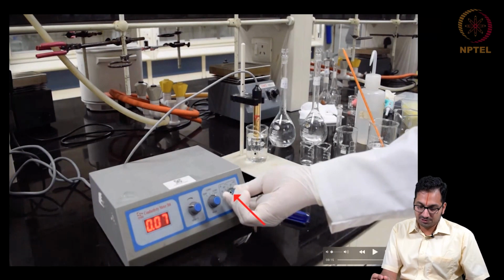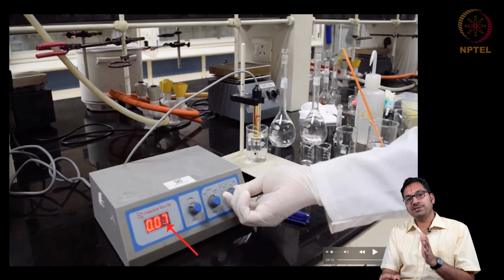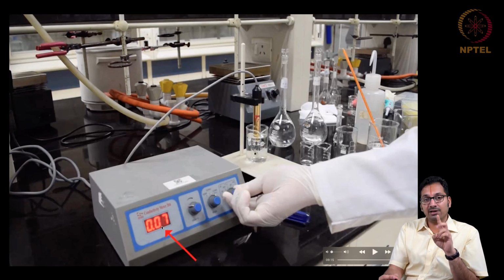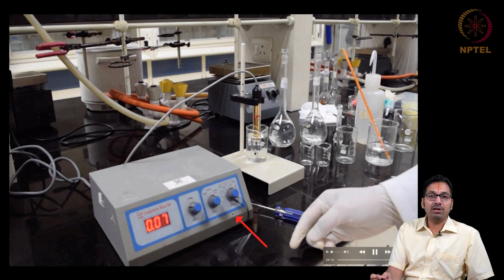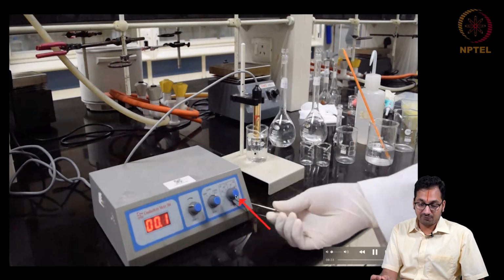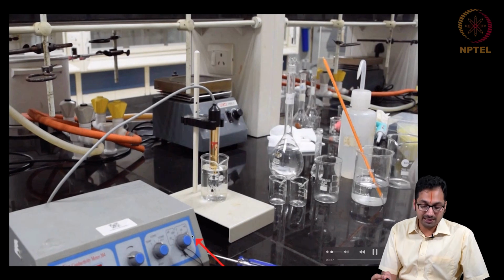So once you are able to change it to 1 millisiemen, you are able to realize that the value from 71 goes to 0.07. You are losing the last decimal, which is 1 here, meaning that from two significant figures you are reducing it to 1. So if you are not setting this value right, you might start slowly introducing systematic shifts that come up due to digitization of the equipment that you end up using. Therefore the scientist is switching it back to 200 microsiemens in order to make his measurements.